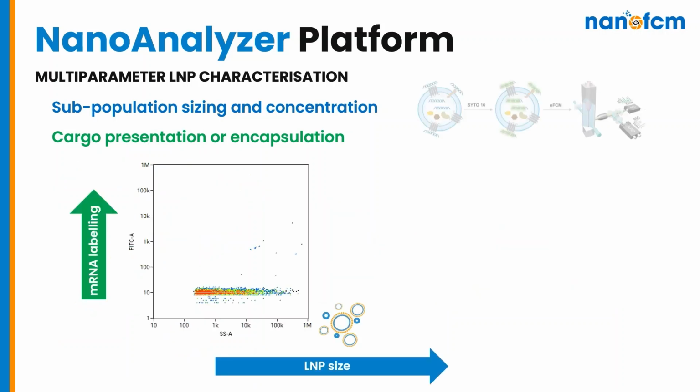And as an example here, we'll look at empty particles exposed to the mRNA labeling procedure. So these are LNPs formed without nucleic acids. And we can sense them in the scatter. The dot plot's full of data that says we have particles, but our mRNA labeling on the y-axis doesn't result in any of them appearing to be positive. So these would all be empty.